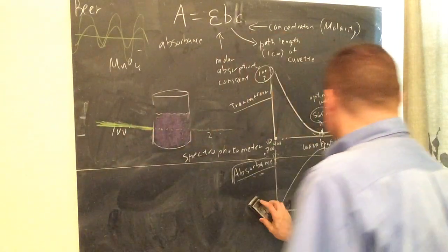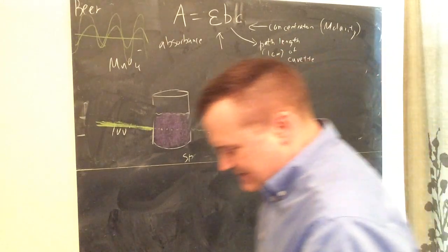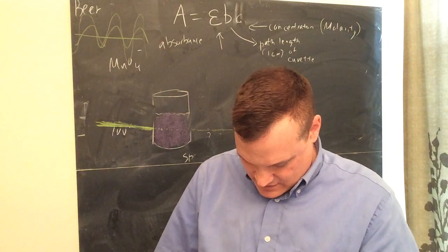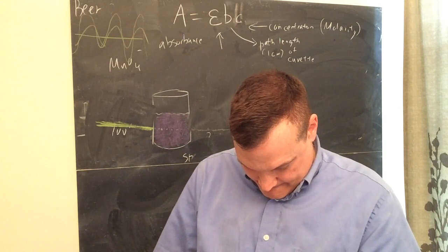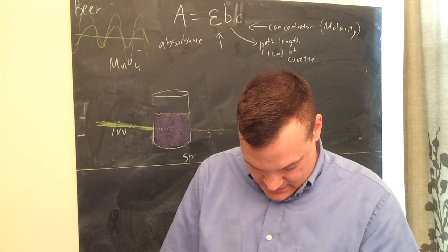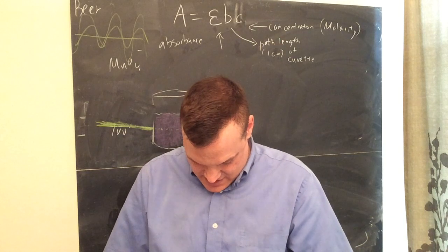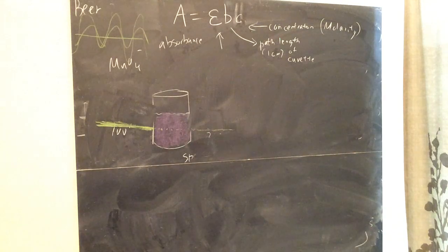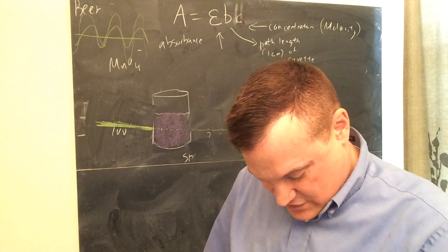What are you going to do next? Now, the next thing you're going to do, you're going to remember that wavelength. Now, in this lab that I'm giving you, we're not going to use 565, I think. Let me see what it says to use. Oh, you know what? I think I could figure out what it would be. What is the one that we used? I'm pretty sure we used a blue color. Yeah, I'm almost certain we used blue because it's an orange, reddish solution. So we used blue, which is 470.